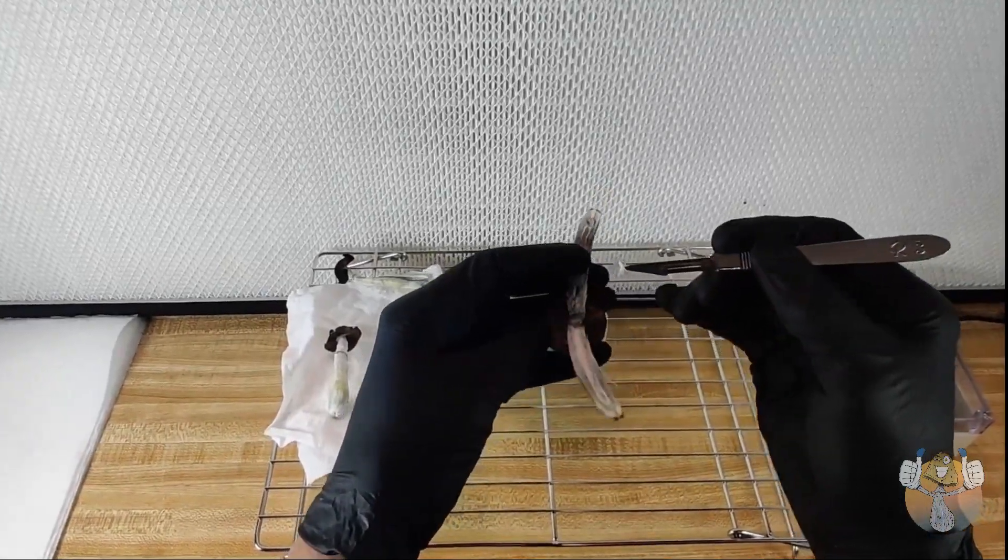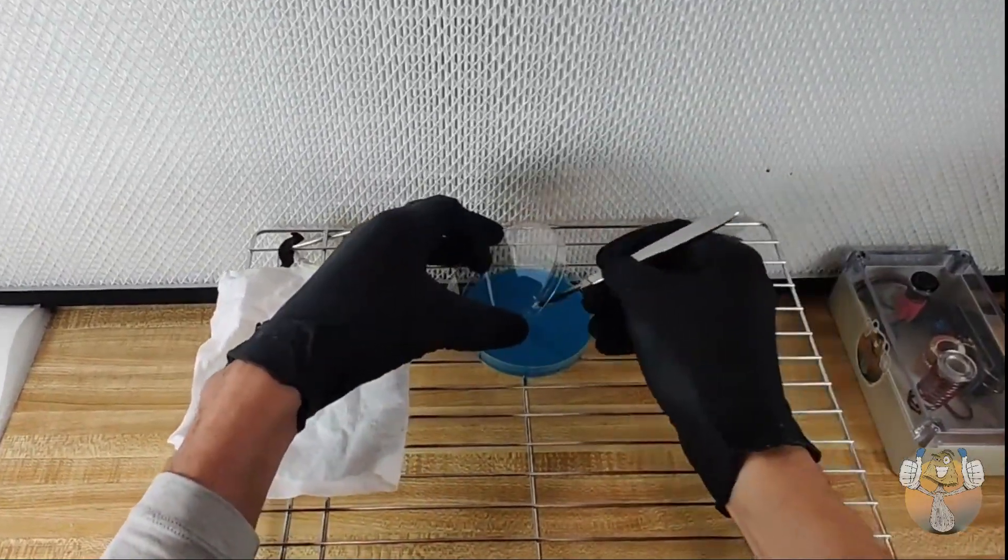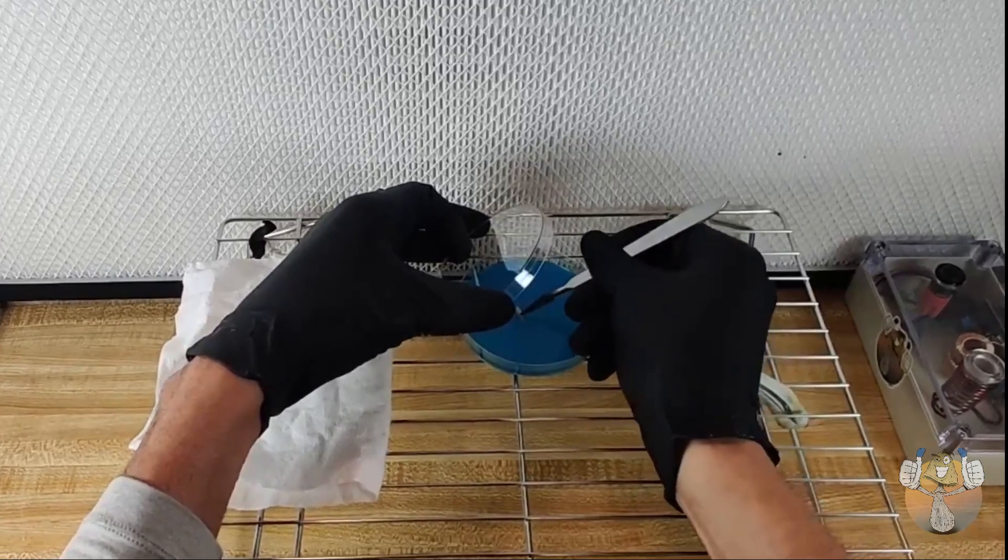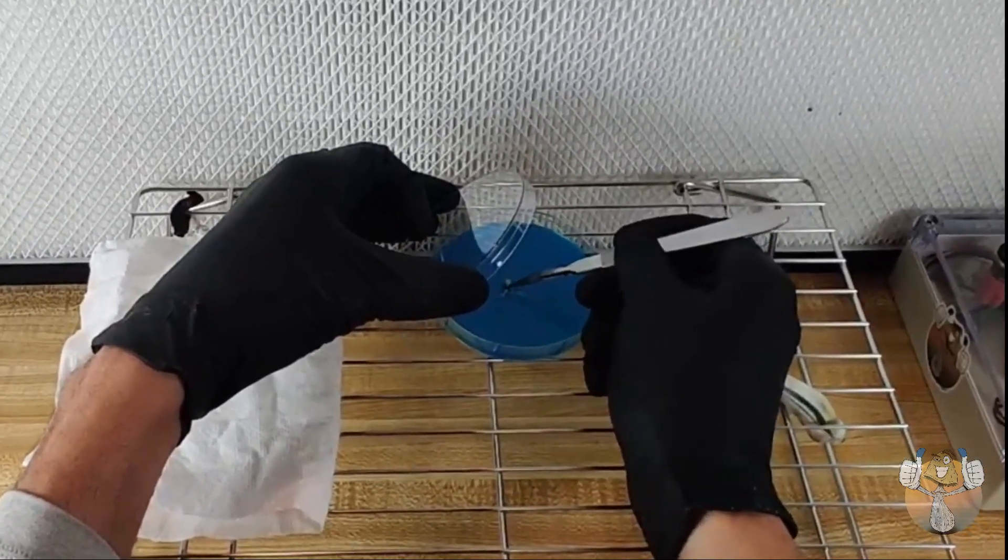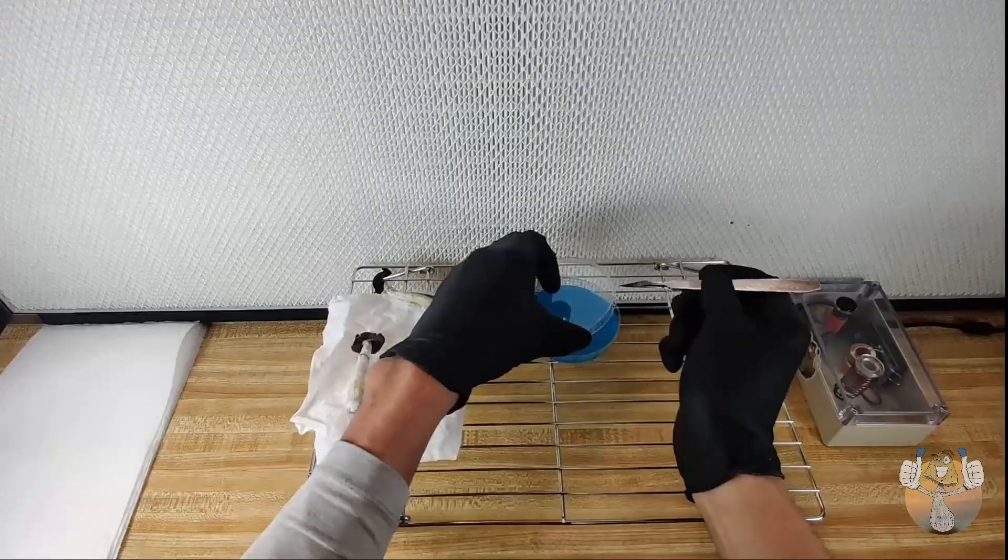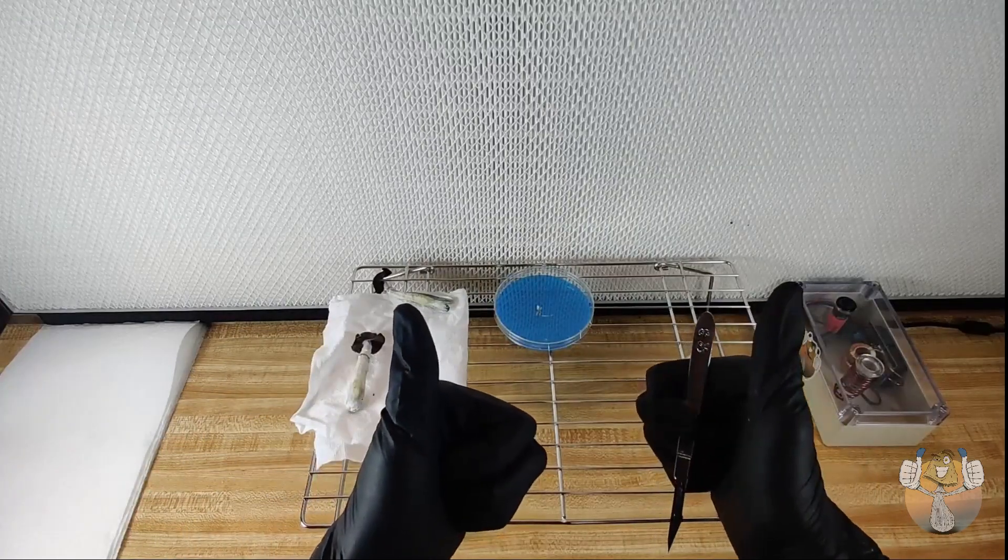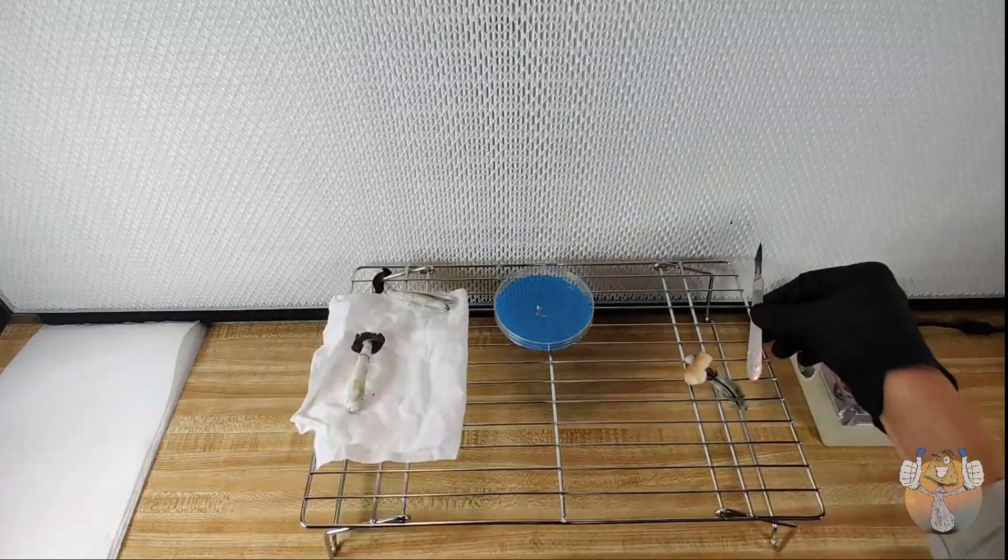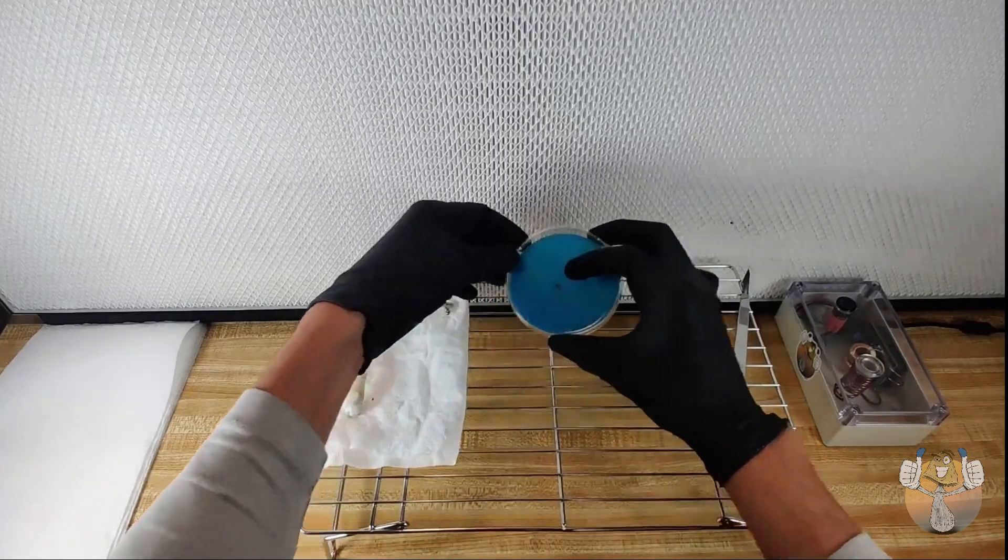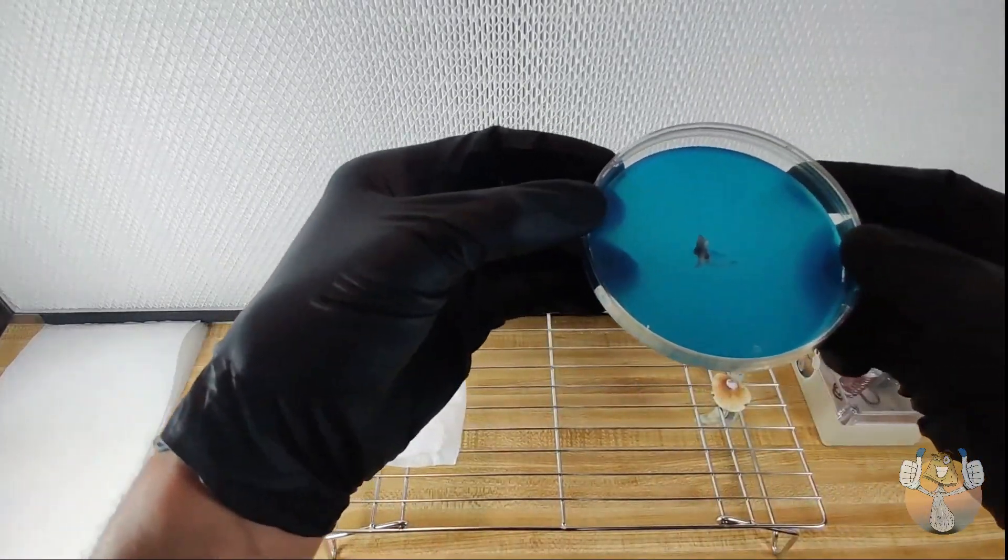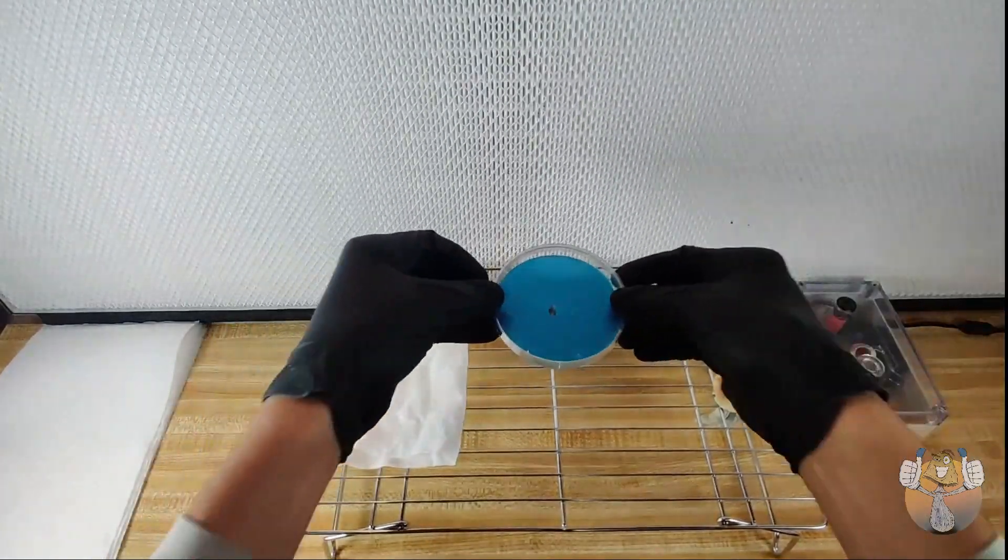I'm just going to go ahead and take some of this stipe material, and we are going to place that onto our agar dish like so. Go ahead, cover it back up, and you're all set. Easy as that. And we have our little piece of mushroom material on our agar dish.